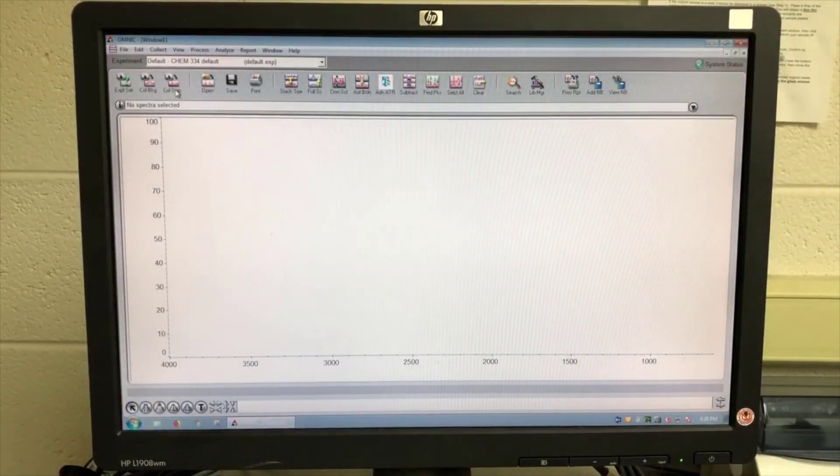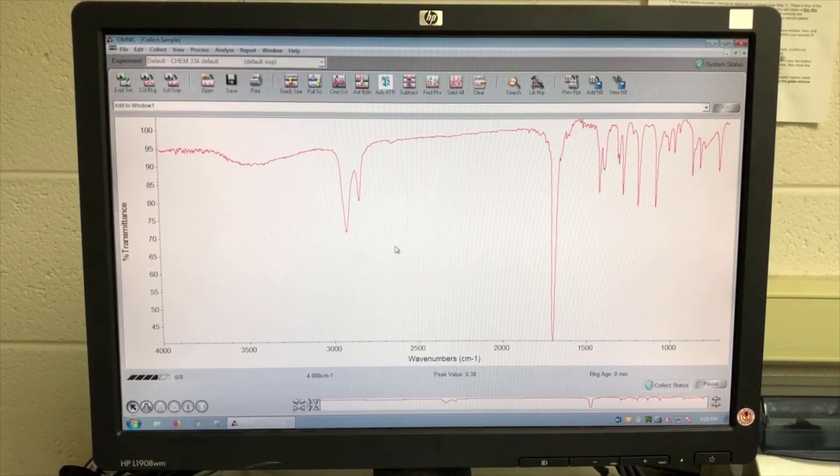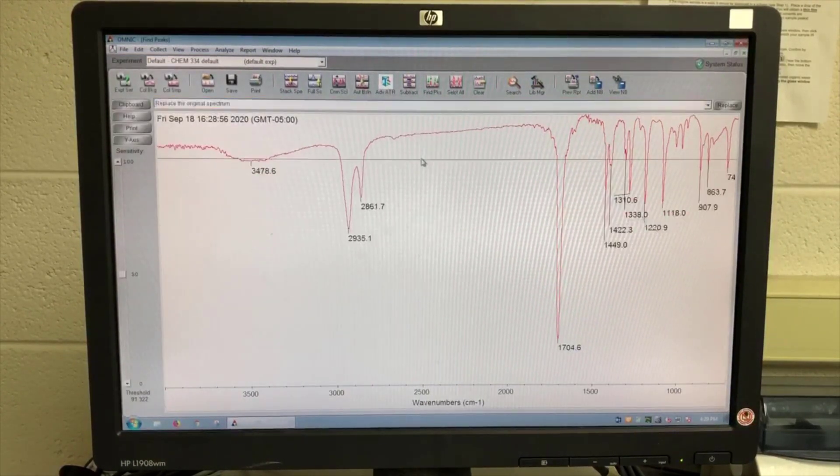Now I'm starting up the OMNIC application on the computer, and I'll hit the Collect Sample button, COLSMP, to get the process started. The experiment collects eight scans, and then displays the average results.